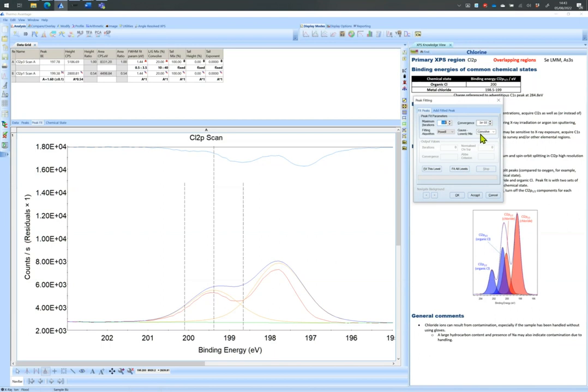Here the fitting method must be using the convolve fitting model, as the peak shape is a convolution of Lorentzian and Gaussian. For a fit using the convolution method, the width for a standard chlorine 2p doublet is around 1.1 to 1.4 eV on this instrument. The Lorentzian to Gaussian ratio, or Lg ratio, is expected to be 20% for that kind of width. For a width below 1 eV, this Lg ratio can increase to a value between 30% and 60%. The narrower the peaks, the higher is the Lg ratio.